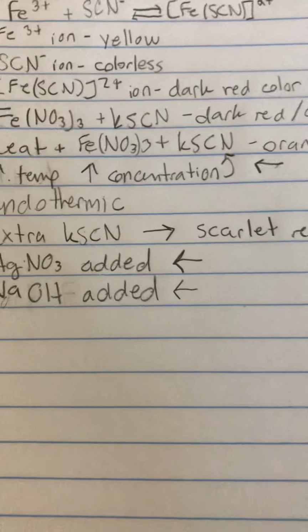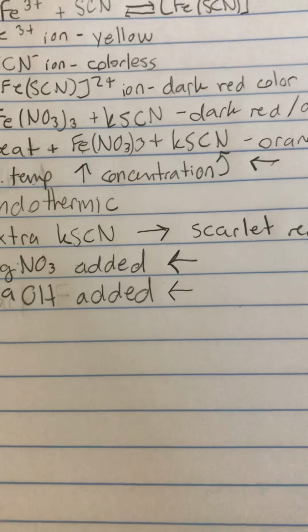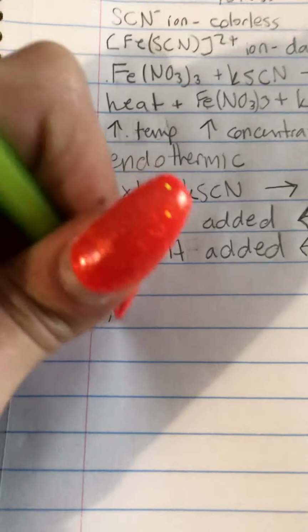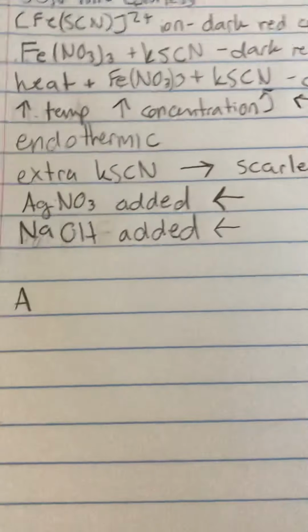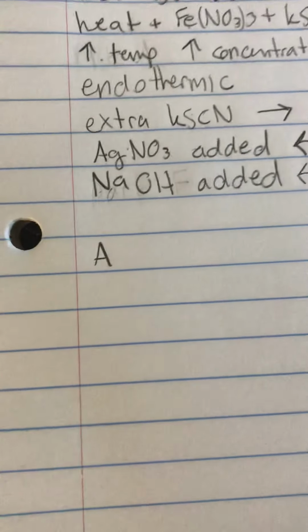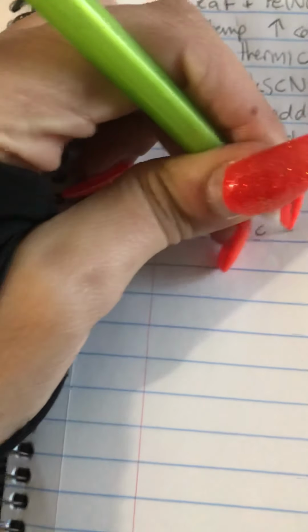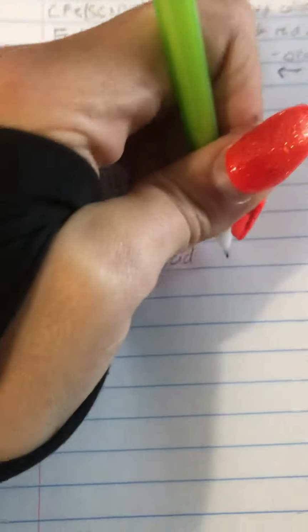And then the next reaction we're going to focus on is reaction A. And this had to deal with mostly pH. So the first question in A is explain the significance of the first pH. So the first pH measured was that of acetic acid, and it was 4.